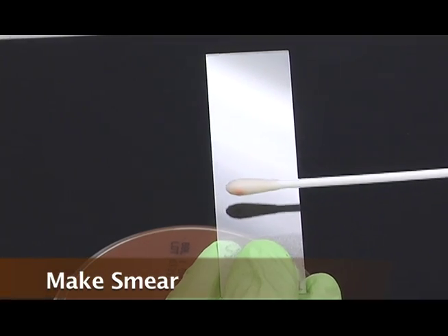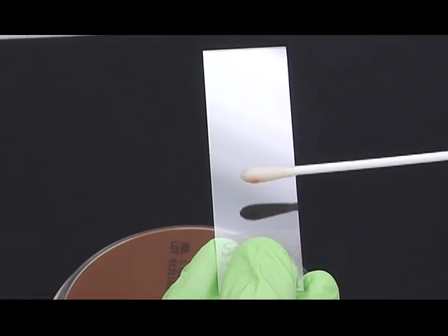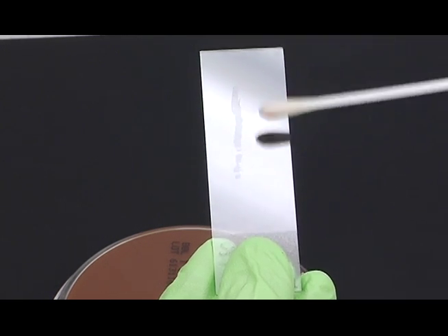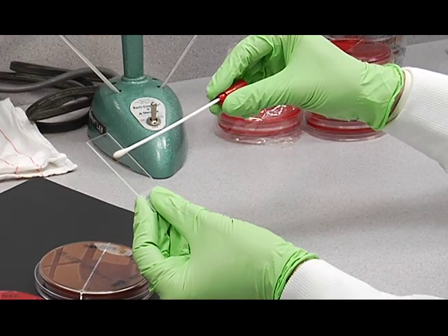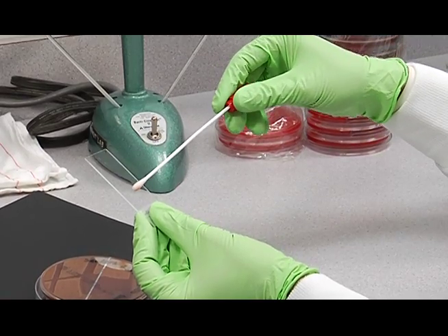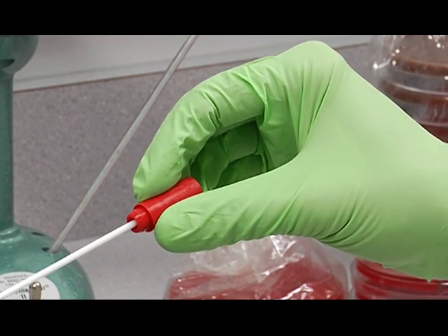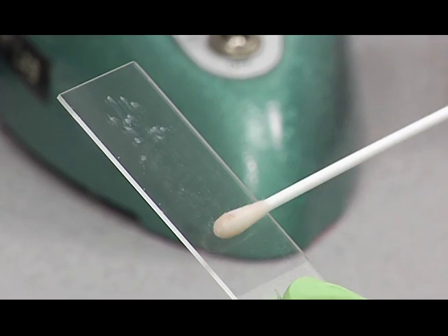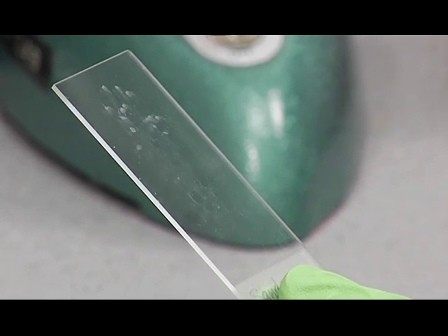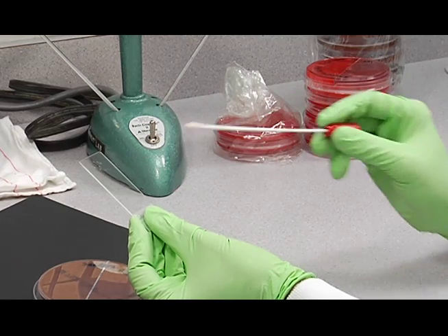Then you're going to make your smear. You want to gently layer the material onto the slide by rolling your swab towards you as you move it away on the slide. You don't want to scrub, because you can destroy your cells and your morphology. Do that until you can see some material dried on the slide.